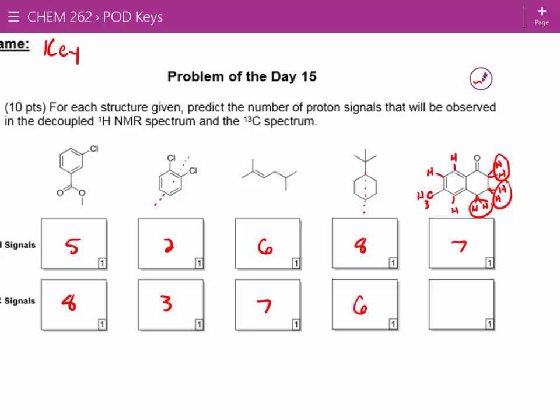It takes very, very little energy to flip an envelope flap compared to a chair conformation. A lot less energy. So if we're looking at this in the NMR, this envelope flap is actually just going to be flipping up and down, up and down, up and down, which, like a helicopter blade, means that these protons that are attached to each carbon are going to share the chemical environment, right? They're going to be in an equal probability of being in that same chemical environment.